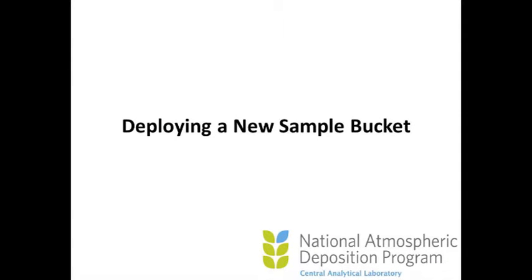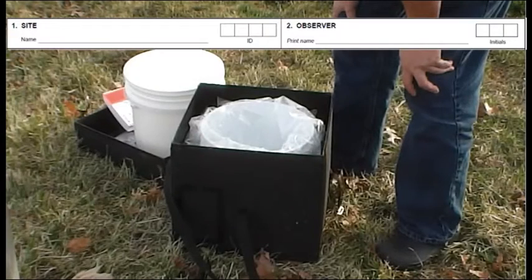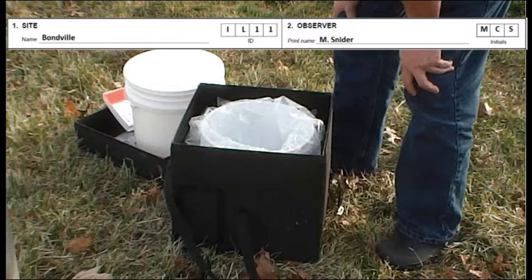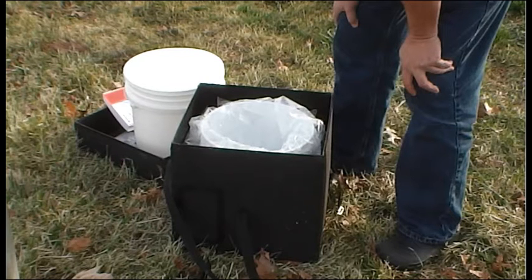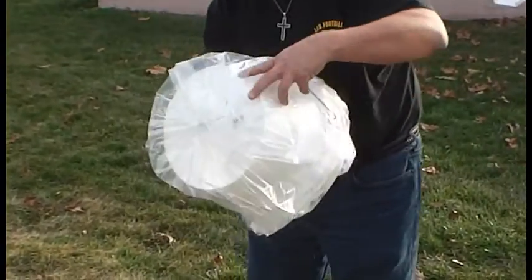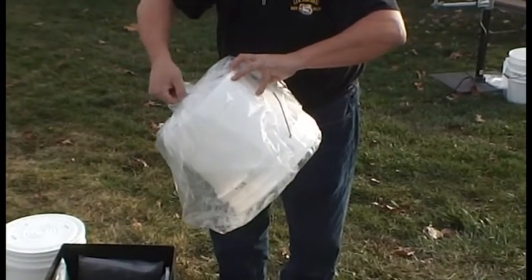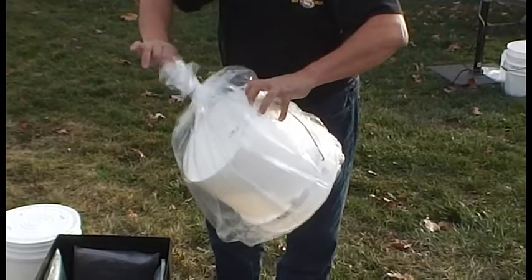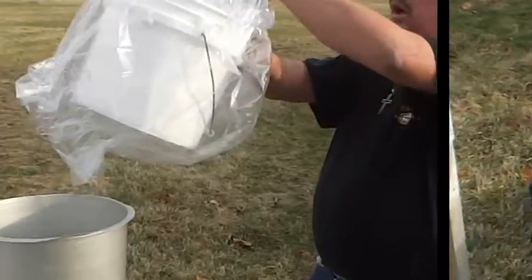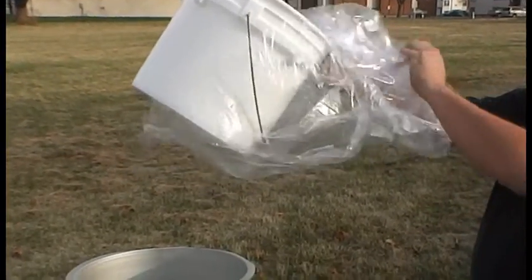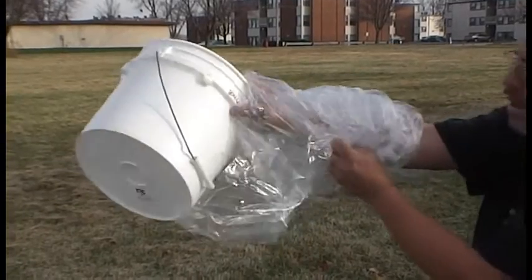Once the old sample bucket has been removed and the equipment cleaned and checked, you are ready to deploy the new sample bucket. Before you begin, record the necessary information to complete Blocks 1 and 2 on your field form for the current week's sample — these are Site and Observer, respectively — including your site name, site ID, your name, and initials. Carefully remove the new NADP bucket from the carrier and hold it by the handle. Remove the twist tie holding the bag closed and pull the bucket bag back over your arm and wrist so it acts as a glove. Before installation, turn the bucket upside down and shake it to ensure no residual water remains from the cleaning process.